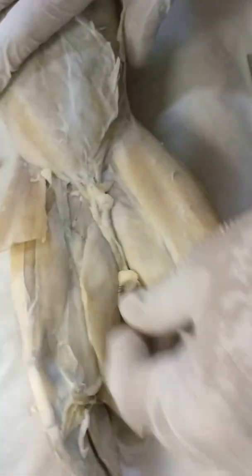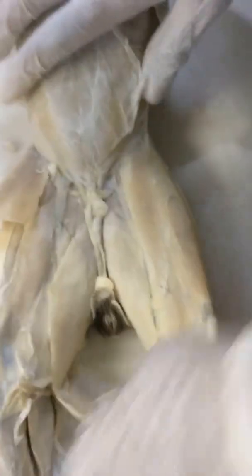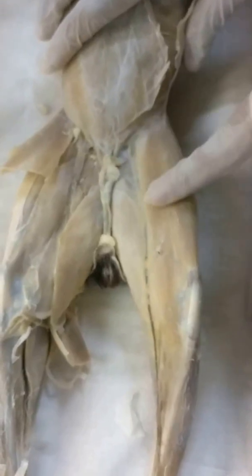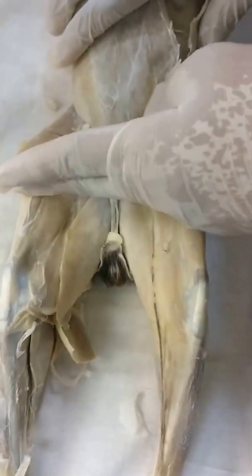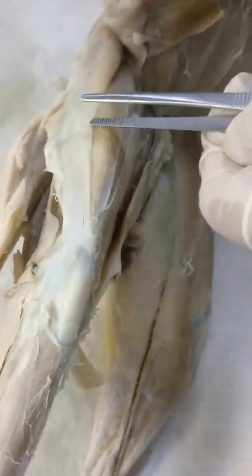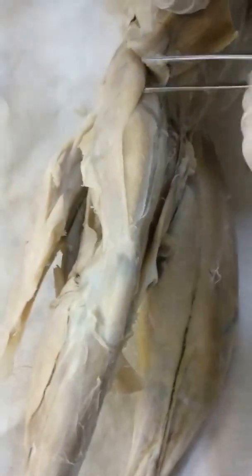Next, this is the sartorius muscle. You need to deflect it — put it in the middle. After cutting it, also try to find it on the side. There is a very thick fascia here; you don't need to remove it. This is the fascia lata.